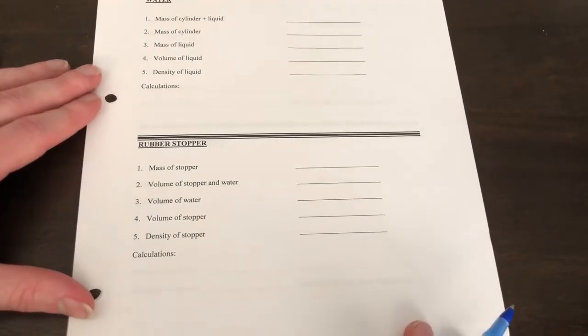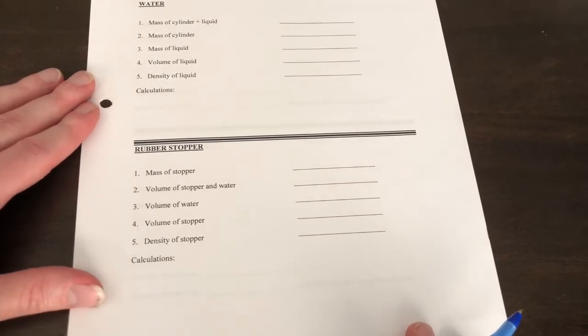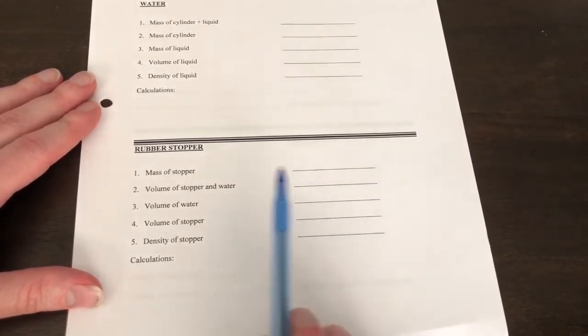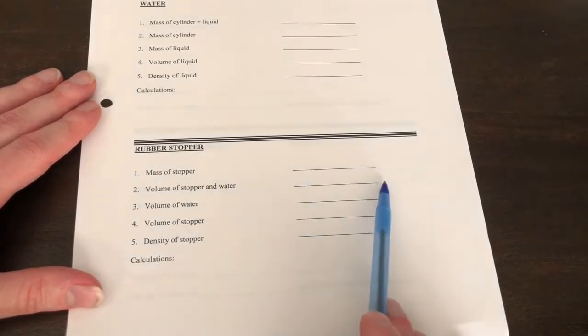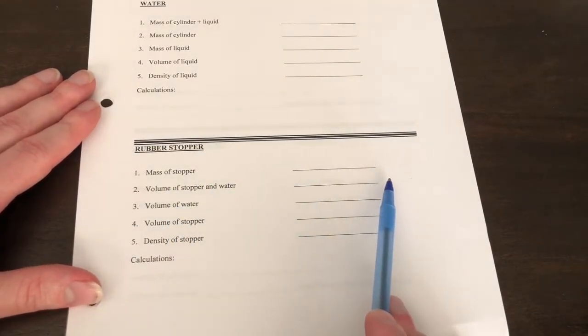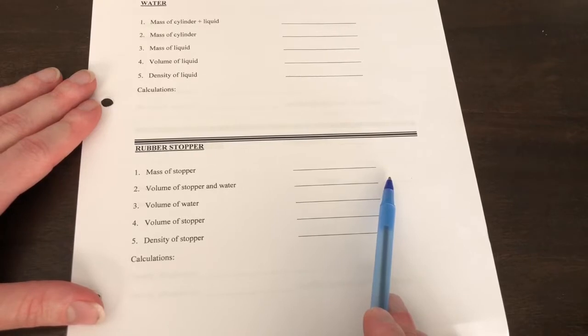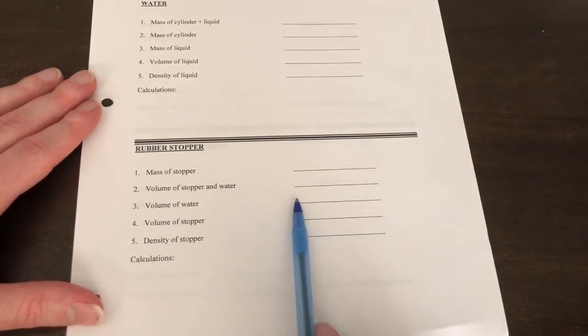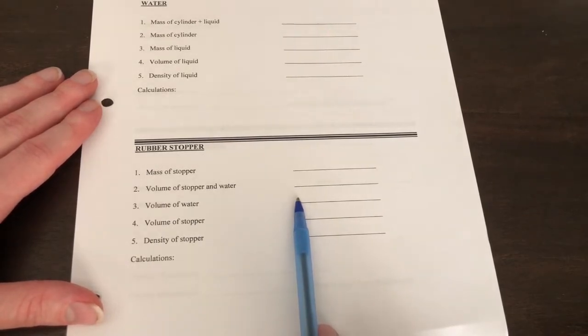Okay, going over a data table for our rubber stopper. The mass of the stopper we get from the scale. The volume of the stopper in water is the volume of the water line once I drop the stopper in. The volume of the water is the initial amount of water that I placed in the graduated cylinder. It's at about 30 milliliters.